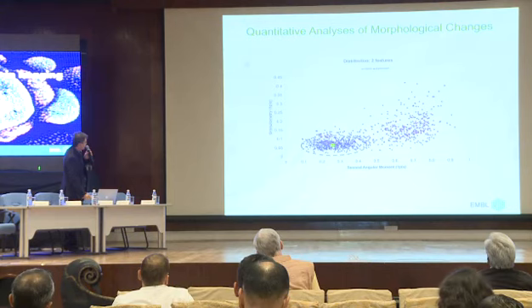And now how can we determine that some of them are changing? It's shown here in a two-dimensional space for better visibility. We have here two of these features. We have the distribution of the controls, which is very important, shown over here. You may say this has a certain center of gravity, which could be the mean value, and also a certain distribution. Then we are asking which of the experimental or perturbed cells show a distance from the center which is longer than 2 standard deviations. It is shown over here.